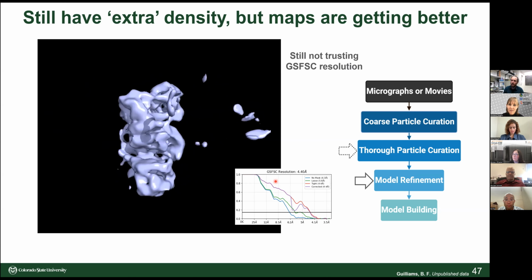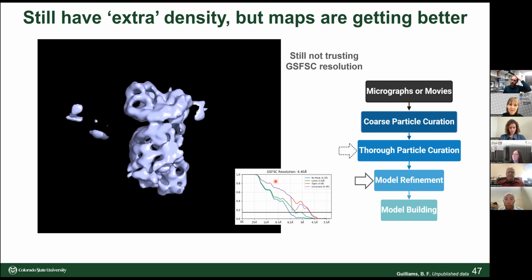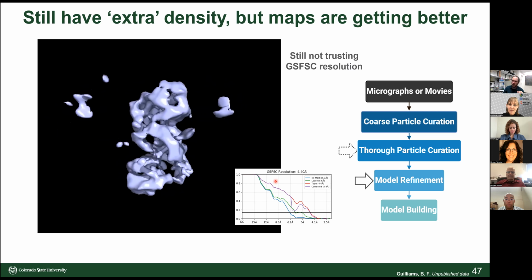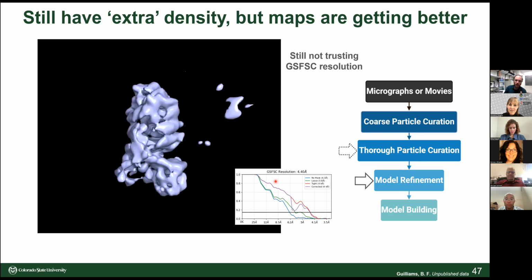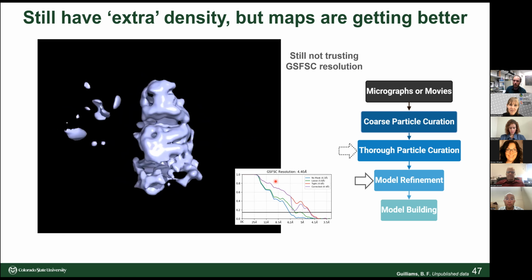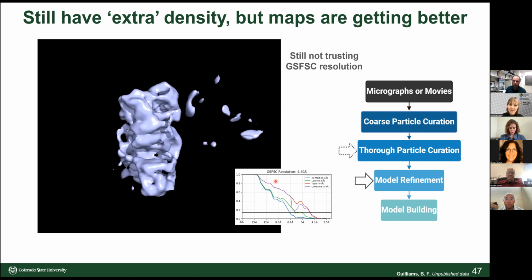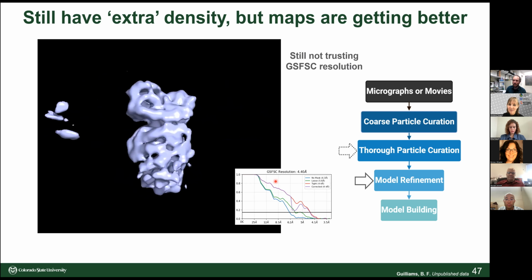And because of the azimuth, I guess, I don't know the name of the plots, but the orientation plots, yeah, definitely there are hot spots. I would say they're not as bad as some that I have seen in my limited experience, but there are definitely orientations to this that look really nice, and some that look, as you rotate it, not nearly as nice.